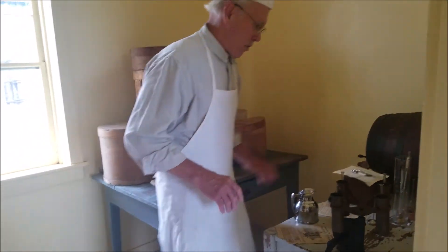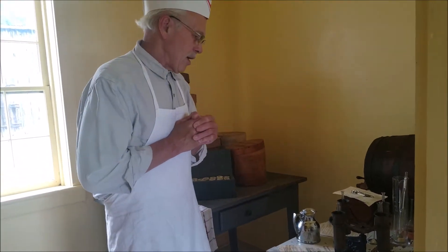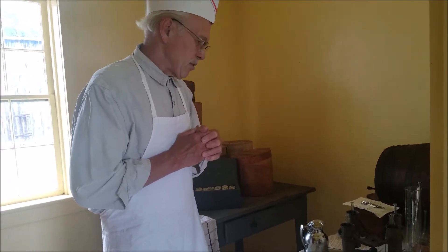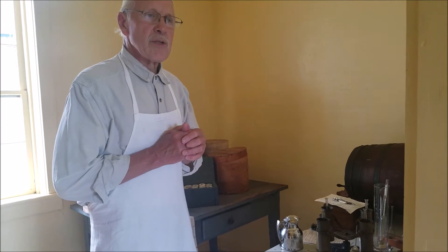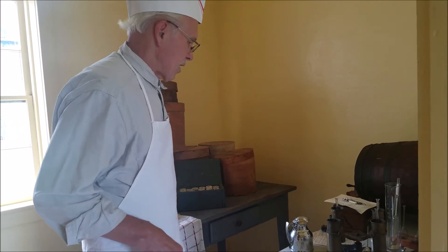I've got a little laboratory here. What we're gonna do is test for butter fat using the Babcock tester. This tester took a long time to get an accurate one that works every time. Mr. Babcock is a doctor — he got his doctorate in Germany. He was born in New York and decided to come to UW Madison, Wisconsin, to finish his career, which lasted 48 years. So he's the man that invented this.